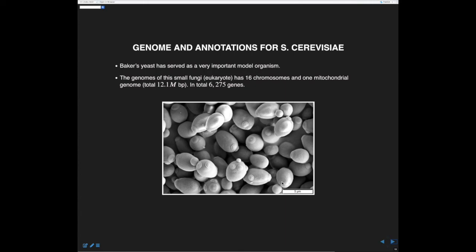So this allows us to download the genome completely into our R sessions. If you're working with the human or most genomes, then it's a little bit more complicated. You need a pretty good machine to store the 3.6 billion base pairs of the human genome and bring that into memory.